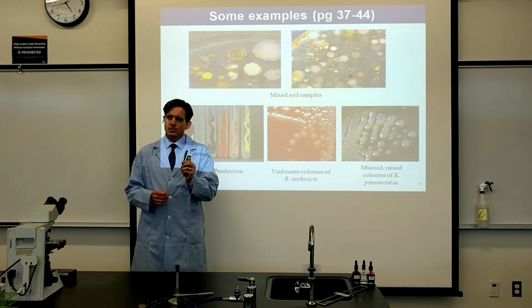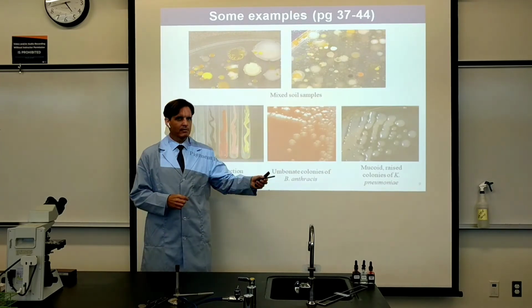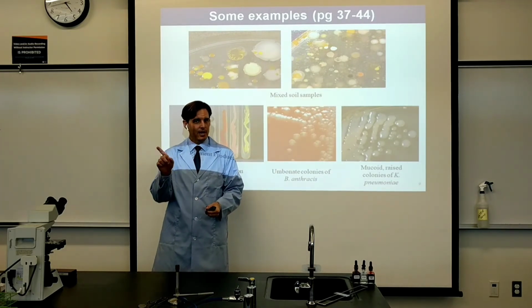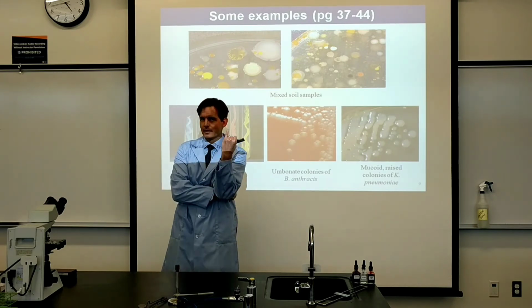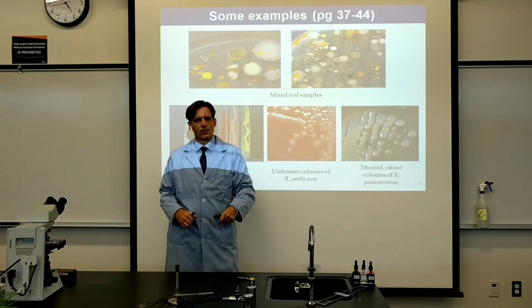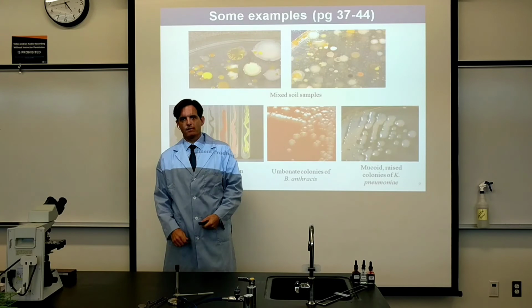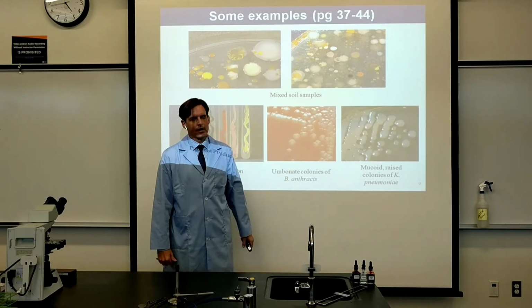And just as a quick note, since I caught it out of the corner of my eye, we were talking about Klebsiella pneumoniae during the capsule stain. You saw capsules under the microscope just now, but check them out on a plate. So here are the mucoid, round, raised colonies of Klebsiella pneumoniae growing on a Petri plate.